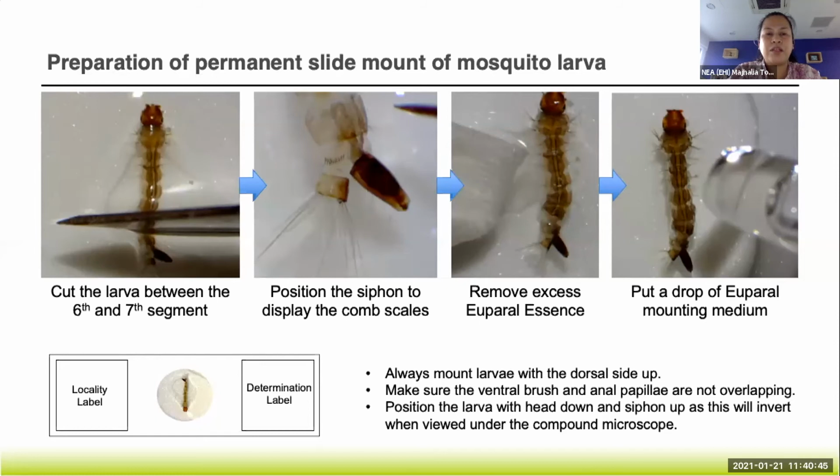So it's not just the larvae acting as a fulcrum underneath your cover slip. The partially dry mounting medium will actually help flatten your cover slip once you put it after 24 hours. So how you do it is that you put another drop of euparal medium under the cover slip before putting it on the partially dried sample that you've put there the day before.